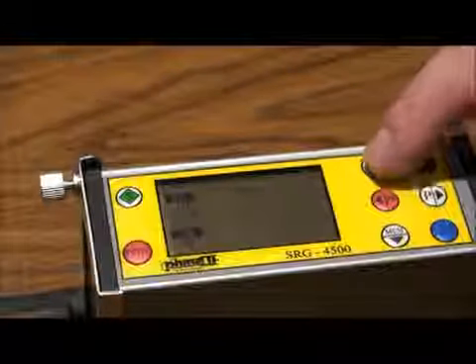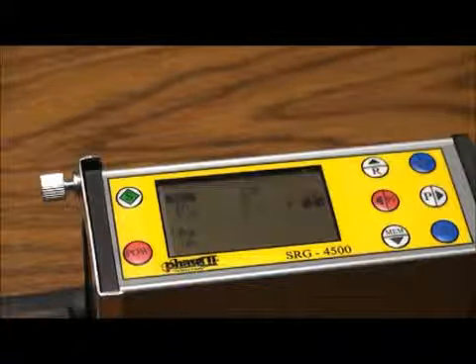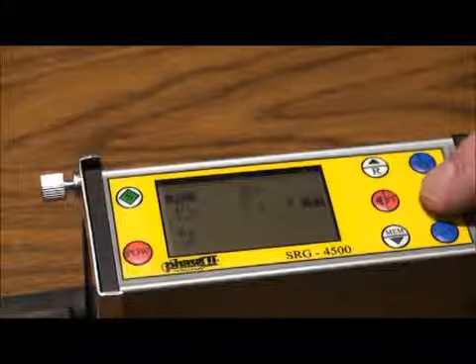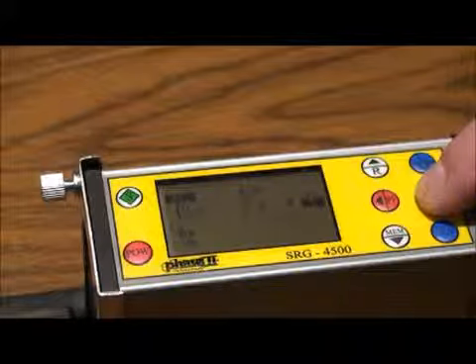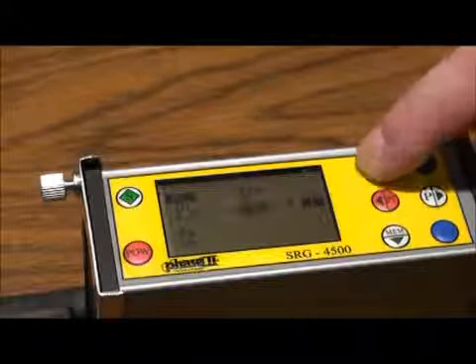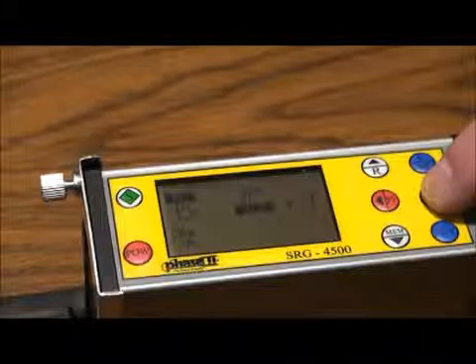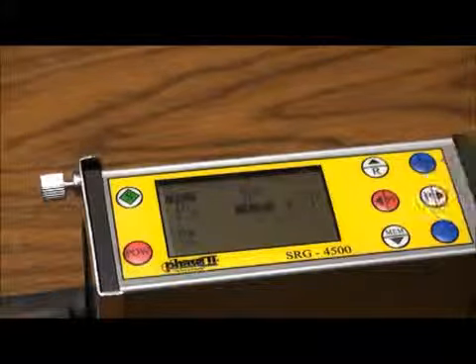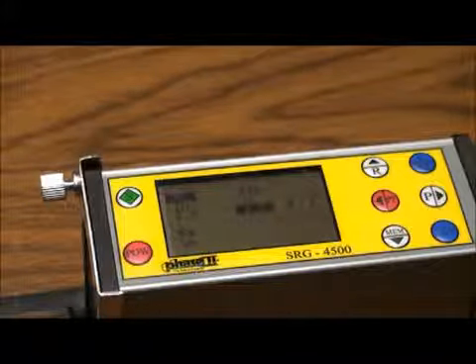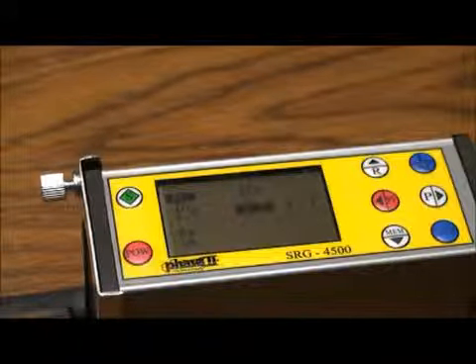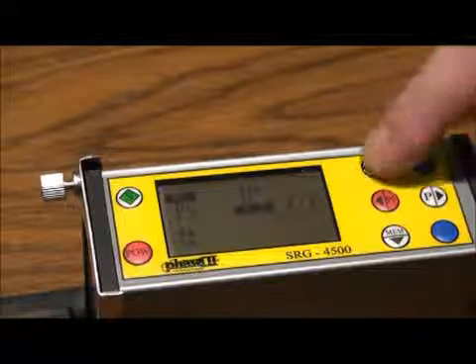Traverse length setting, which is the amount of consecutive cutoff lengths to be evaluated in a given test. Cutoff length, which is the sampling length of the test. The correct value is determined by approximate surface roughness. This can be referenced in a chart in the operation manual showing various ranges. And finally, range of tests.